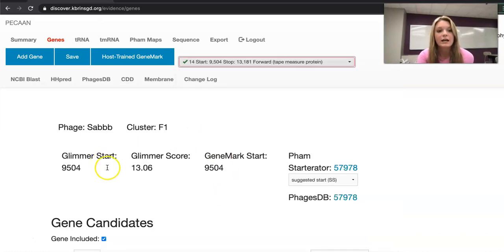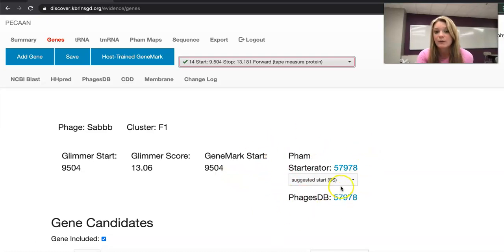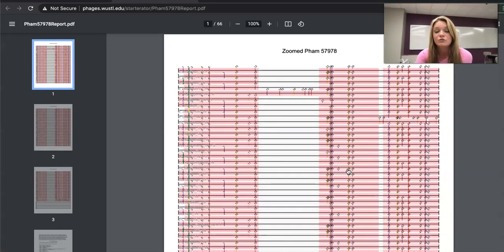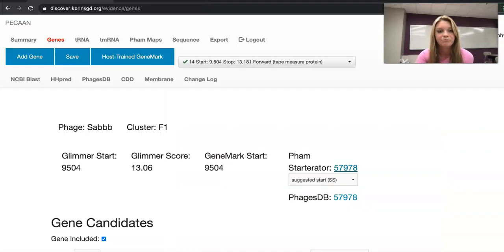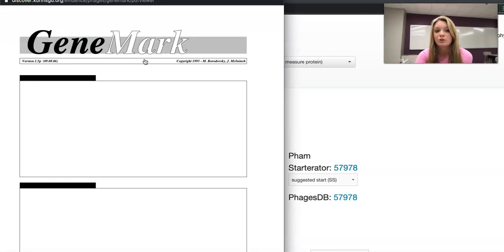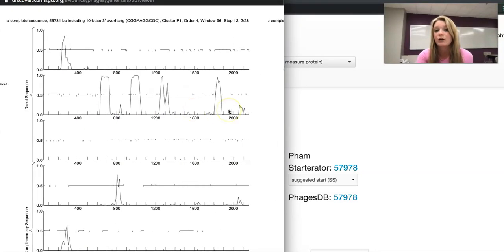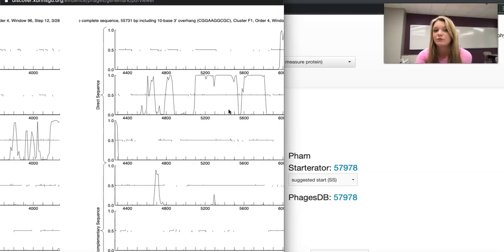Once I click that, Glimmer is showing the start at 9504 base pairs and GeneMark is calling the start at 9504 base pairs. Right here at the FAM starter rater you can click this link and it'll take you to the starter rater report. To the left top of the screen you see host trained GeneMark which you can also click and it will show you the coding potential for gene 14.